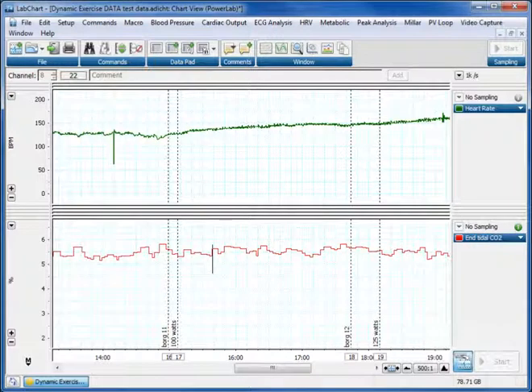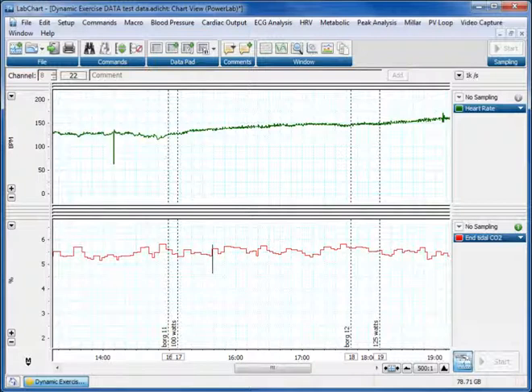Hi, it's Dr. Clark here again, looking at LabChart to do some analysis and presentation graphics. This lesson is all about taking data from within LabChart, editing it in an external application for presentation, publication, or putting in a report.